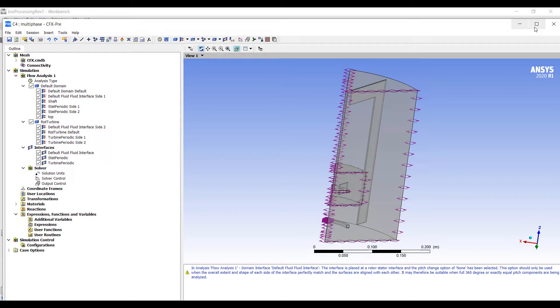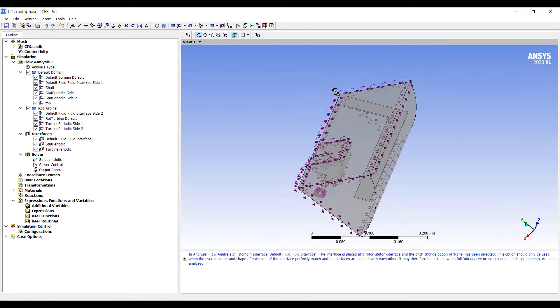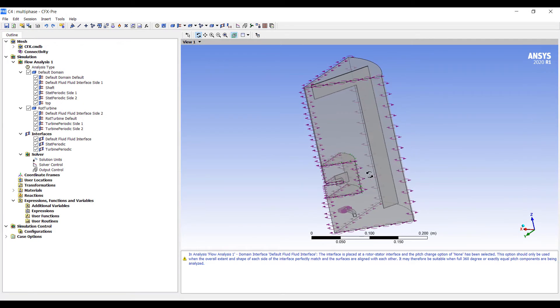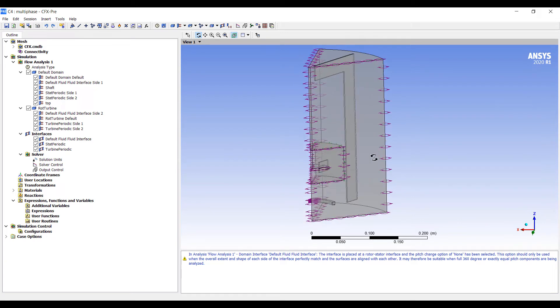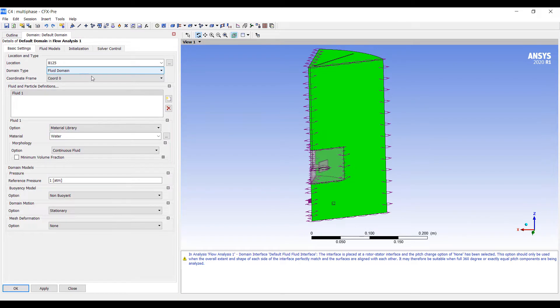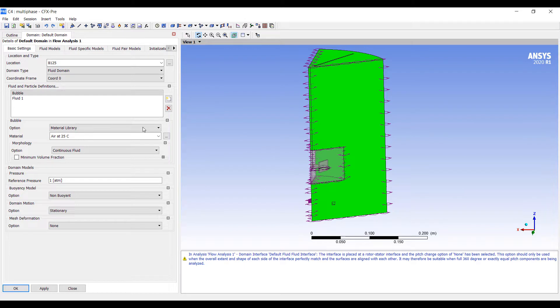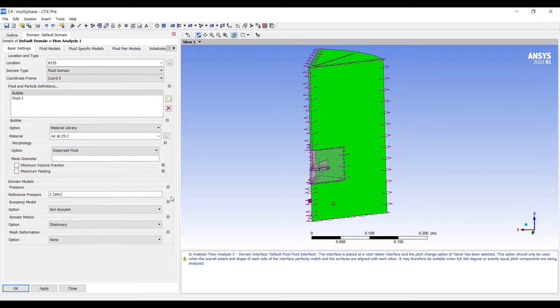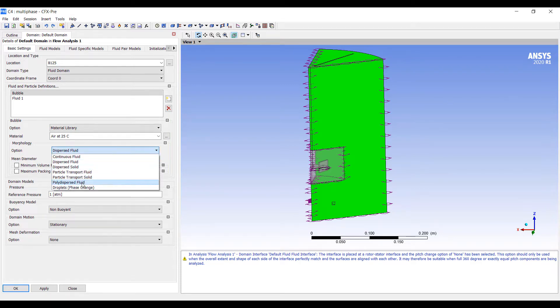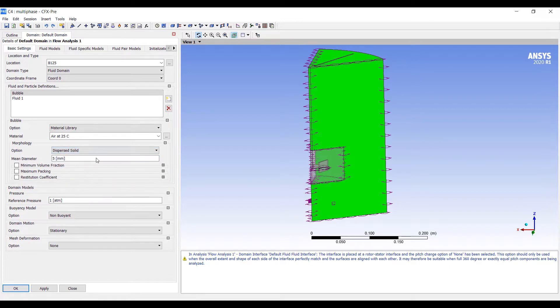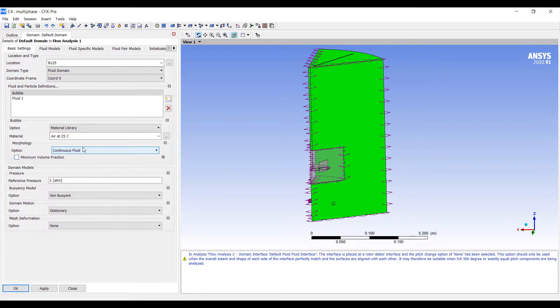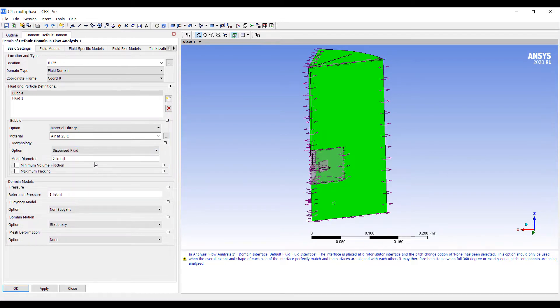Setting up our simulation, continuing from our reactor here, we're going to go to our default domain and add a new phase. We'll call this the bubbly phase. There will be air at 25 degrees Celsius, dispersed fluid, and a mean diameter of 5 millimeters. There are options for polydispersed fluid, which allows us to give different diameter sizes. But for now, we'll go with a fixed diameter.